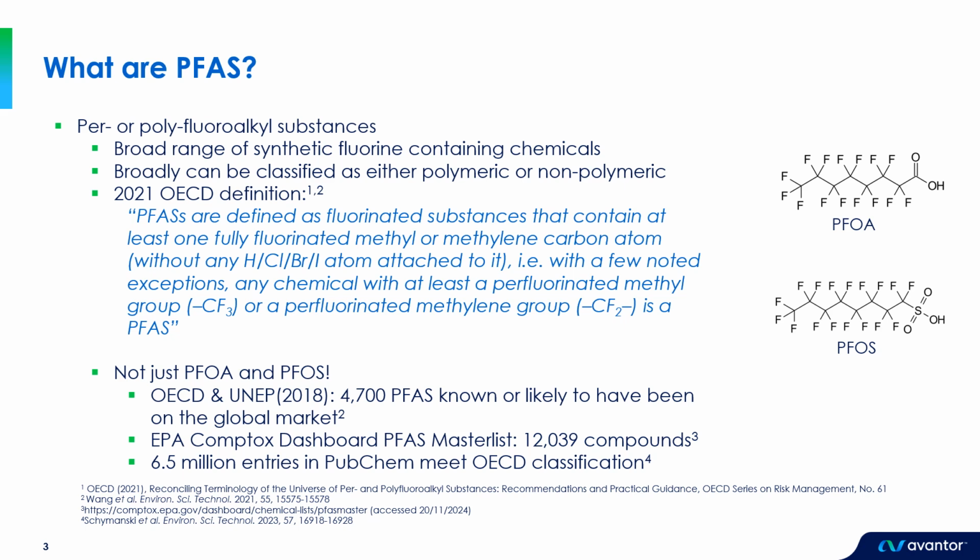I thought a good place to start is with a definition of what PFAS actually are, as there have been quite a lot of discussion over the years as to how best to define them. And this is an important point as we move towards regulating and restricting their use, as we need to ensure we capture the chemicals we need to restrict.